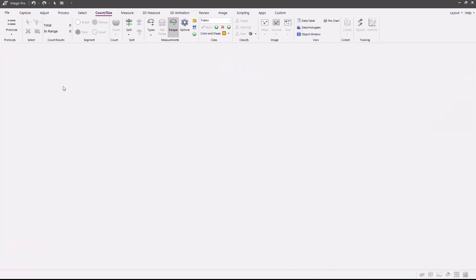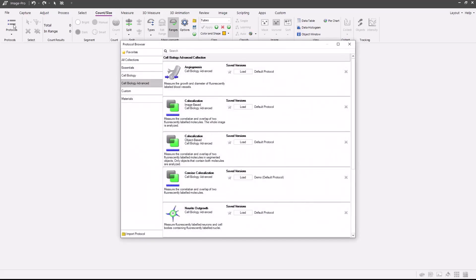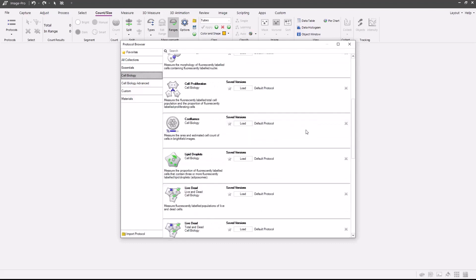First, we're going to select the count size ribbon. Then we're going to press the protocols button. Locate the cell biology collection, select the lipid droplets protocol and simply press the load button.